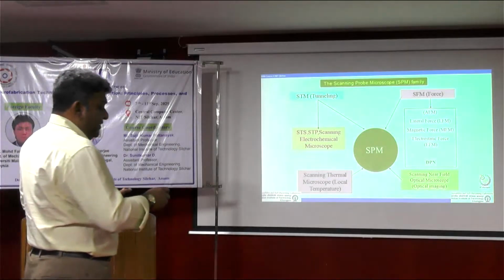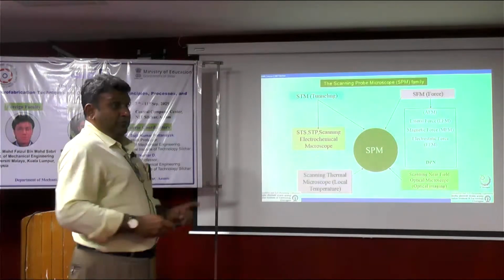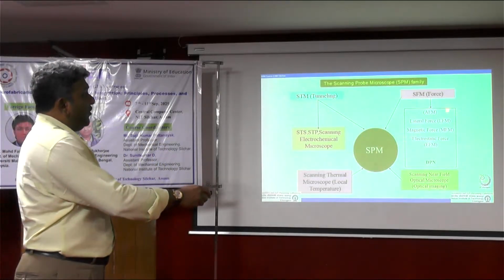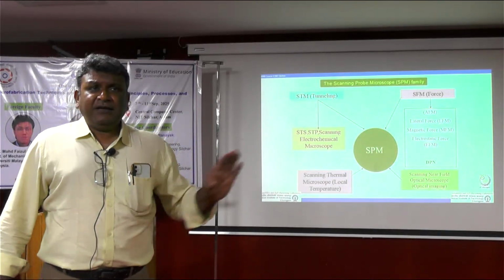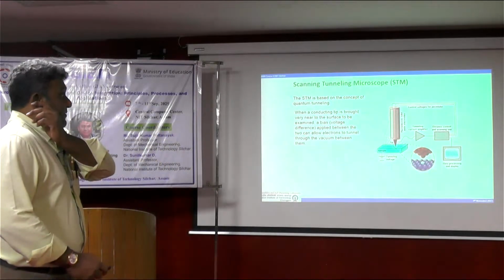So two things we are going to talk about. One is the scanning tunneling microscope, because this is the fundamental basis. So maybe 10 minutes we will spend on that. And then we will move on to the atomic force microscope. But there are a whole lot of other things that can be done with the same platform. So I will just touch upon glimpses, but not go into the depth.